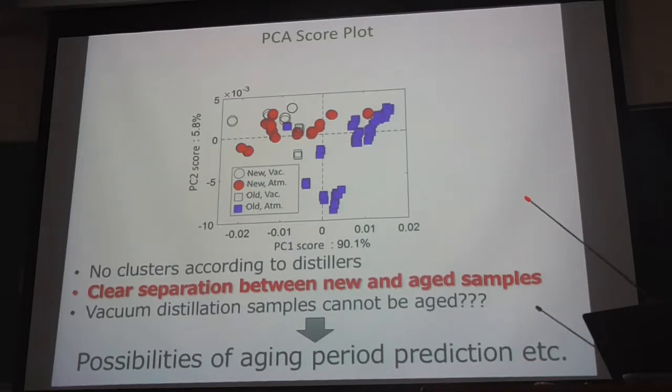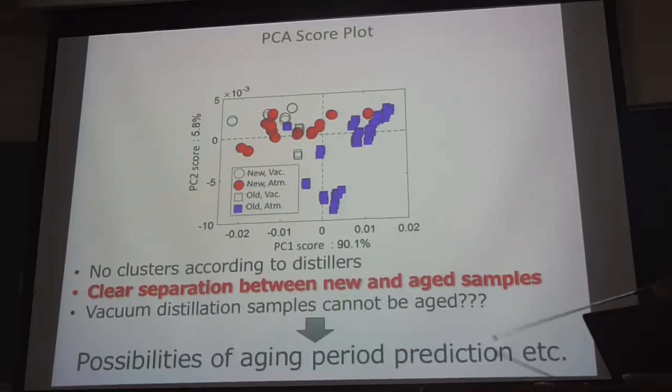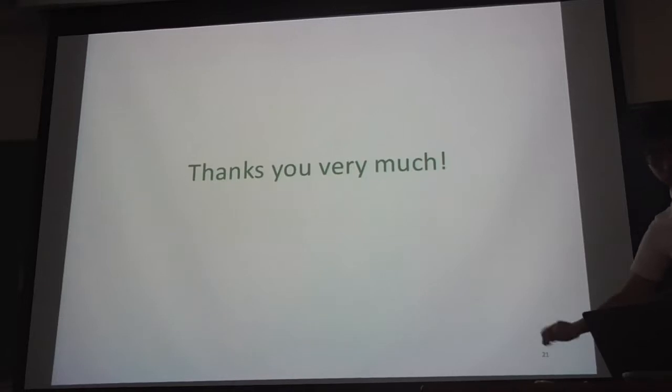So maybe we can use this excitation emission matrix technique to predict the aging period on Awamori. Okay, that's all. Thank you very much.